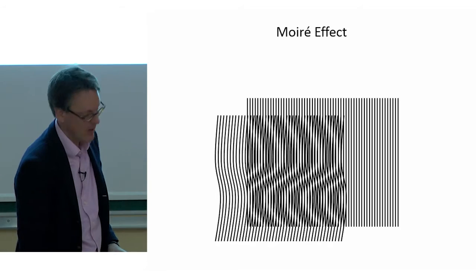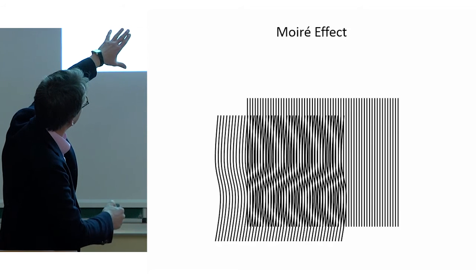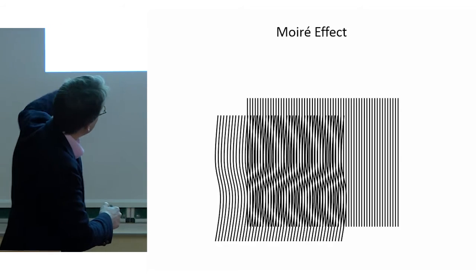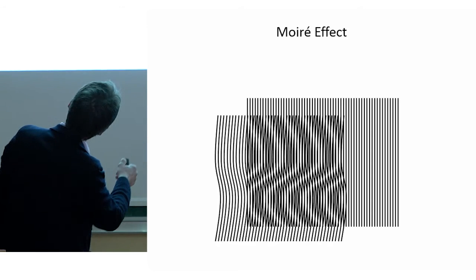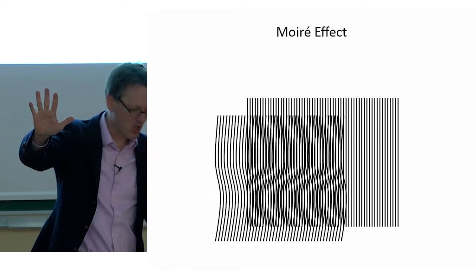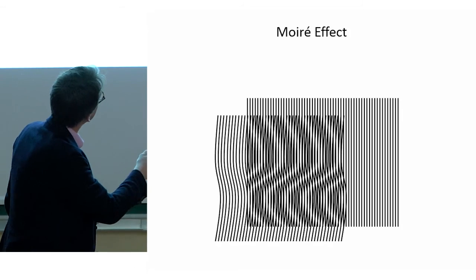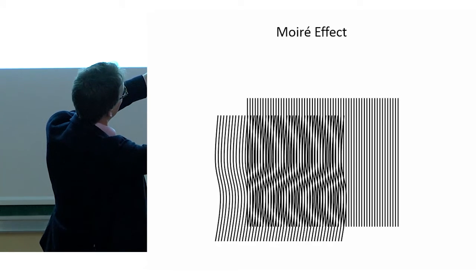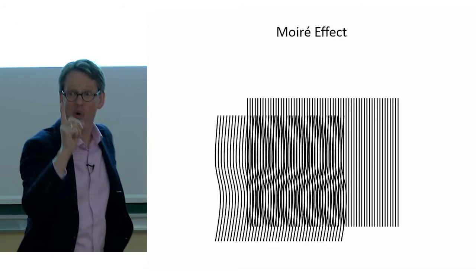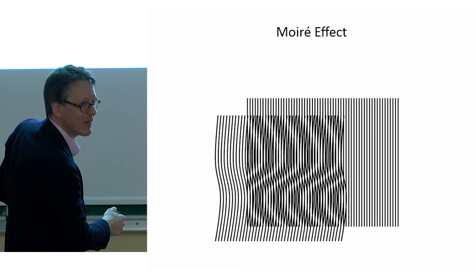Very easily. Think about this point here. If I have an object that contains wiggly lines, this is this lower structure here, right? Wiggly lines. There's a high spatial frequency in this direction and a low spatial frequency in this direction, in this image. And now, rather than illuminating this image with a homogeneous light field, let me illuminate it with a patterned light field. So now I have a spatial frequency pattern in the illumination, and I project it onto my sample. So now I get a product. I get the product of the excitation light with the object function, right?